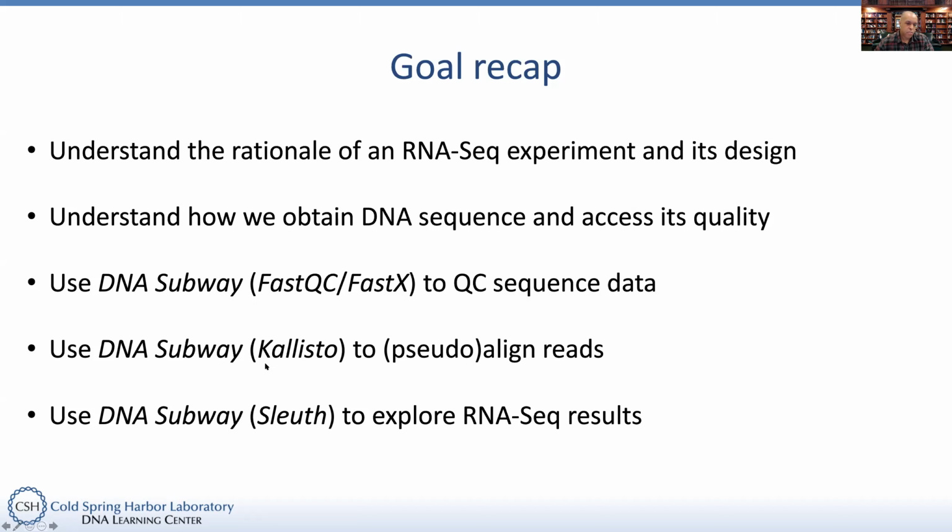And then there's a toolkit, in our case Kallisto, which is our way of generating counts of reads, mapping them and normalizing them. Once you have those counts, you can subtract away the variance that doesn't matter and use some statistics, which I didn't go into, but they're in the sleuth paper, so pay attention, you need them both, in order to explore those RNA-Seq results. And then you can use other methods like ontology enrichment to do more.